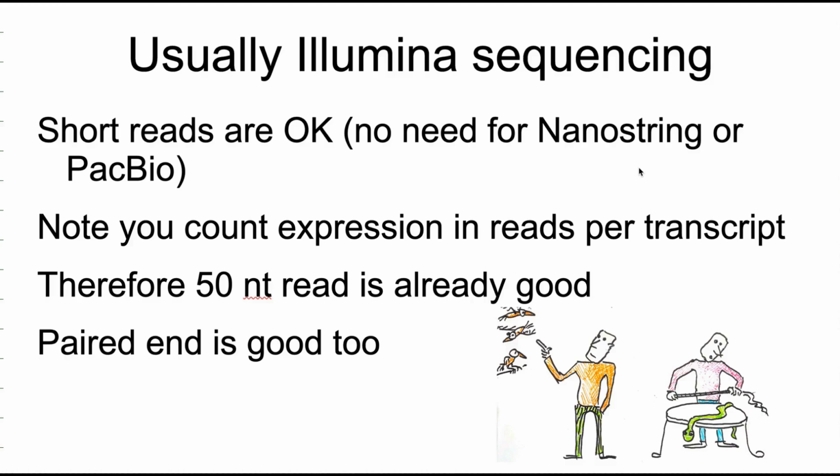If you prepare RNA-seq data by yourself, then you will probably use the Illumina sequencing platform, which makes short reads, and short reads are okay for RNA-seq analysis. Note that you count expression by reads per transcript, and therefore the read length should not be too long. To the contrary, it should be short enough to be economic and efficient.